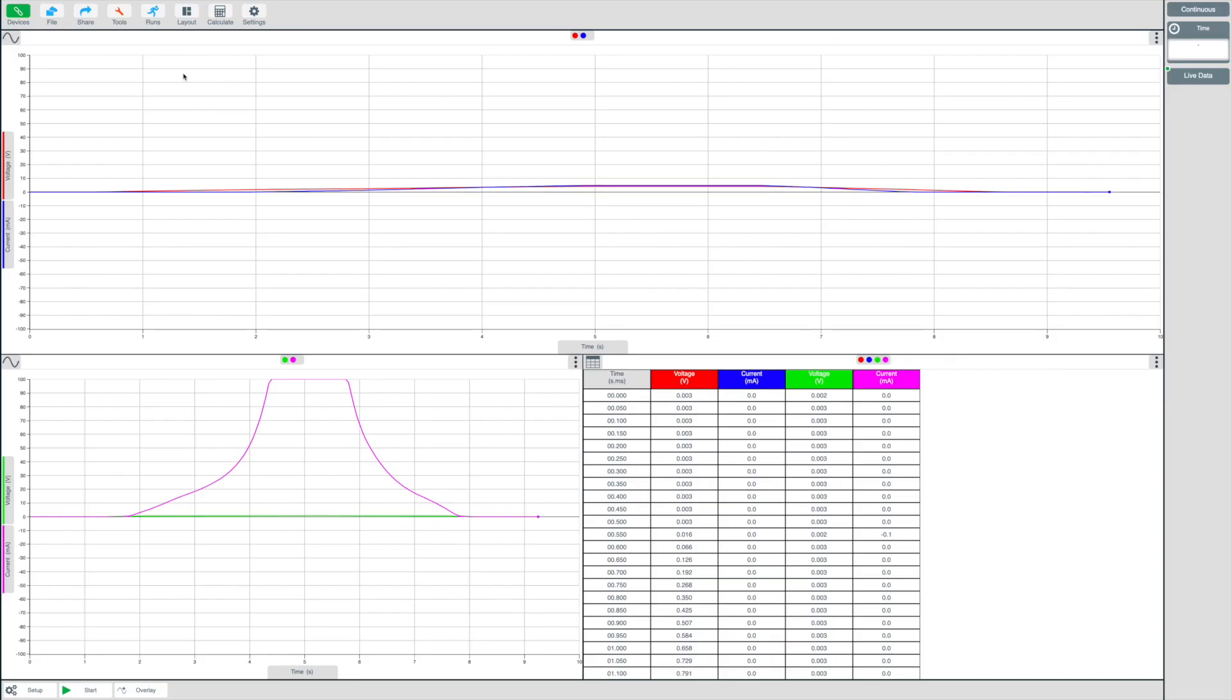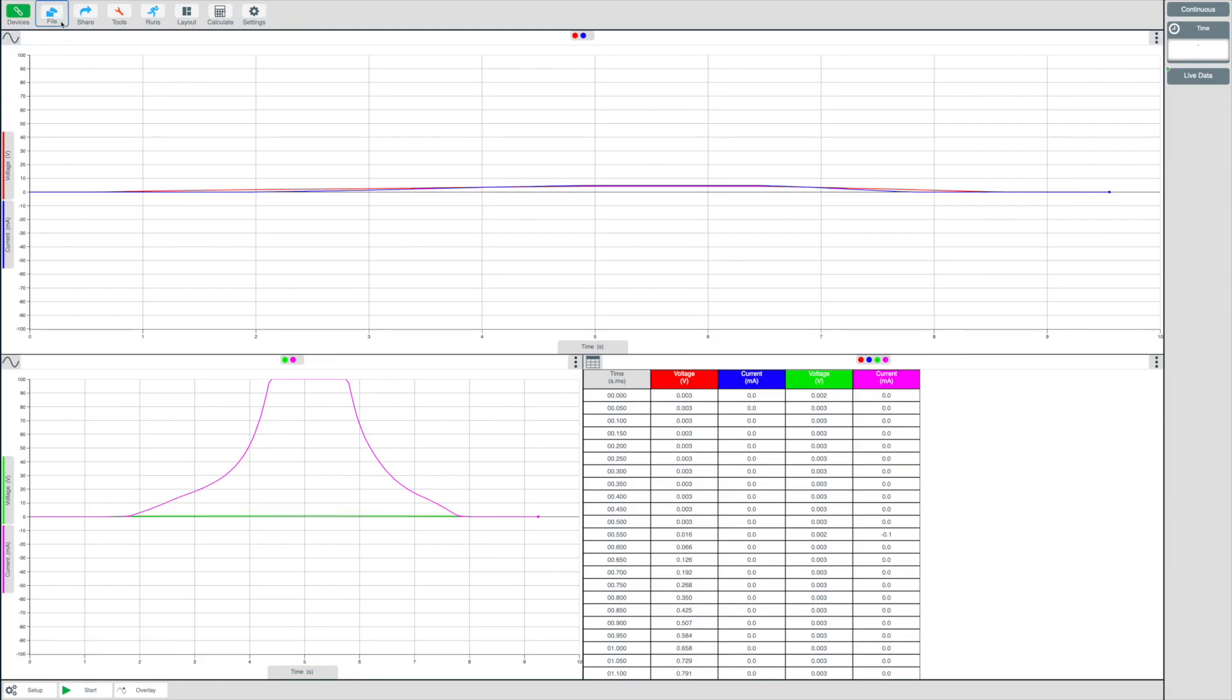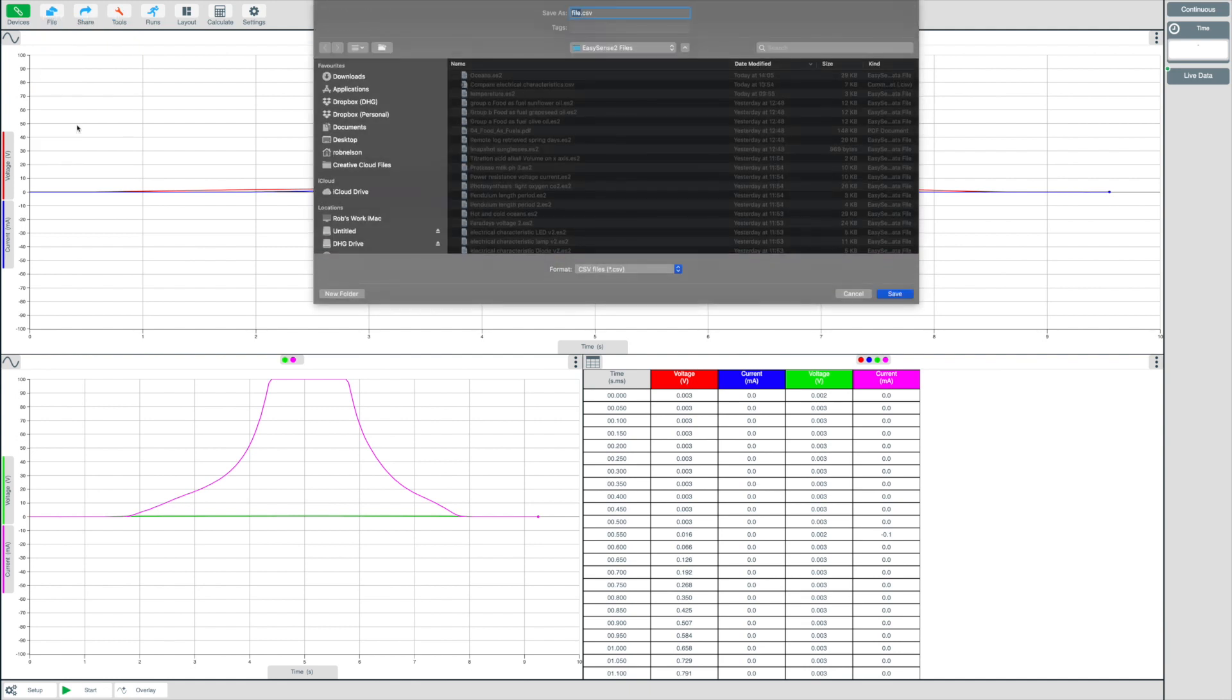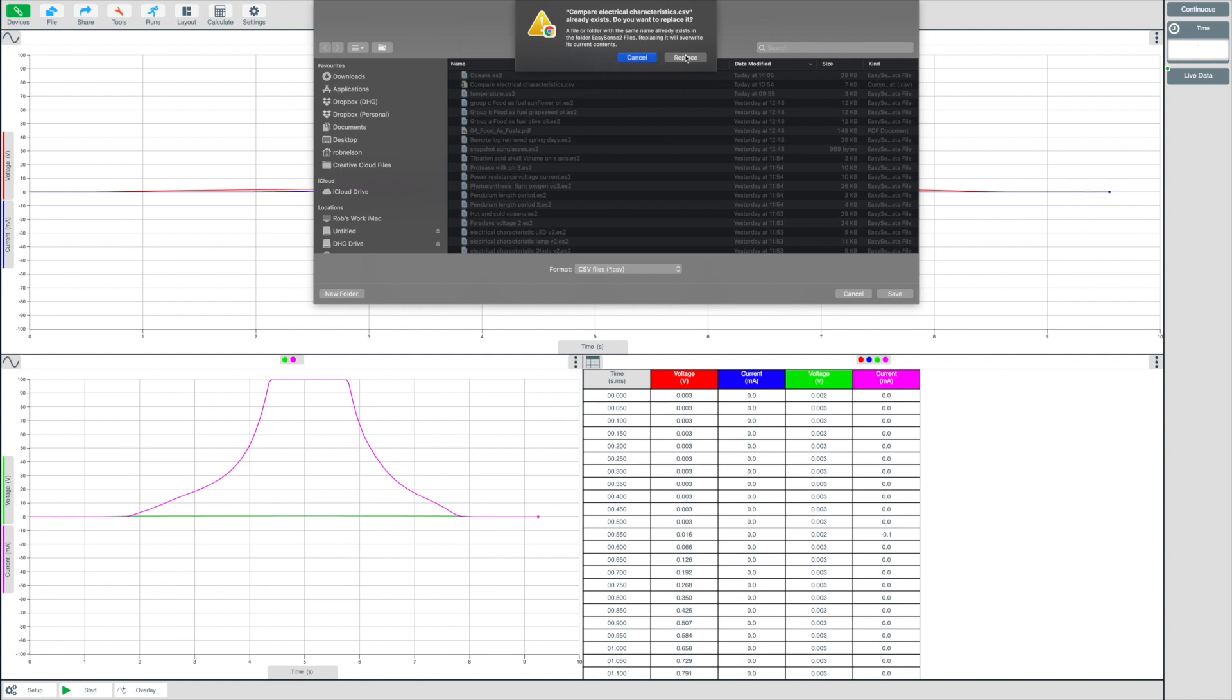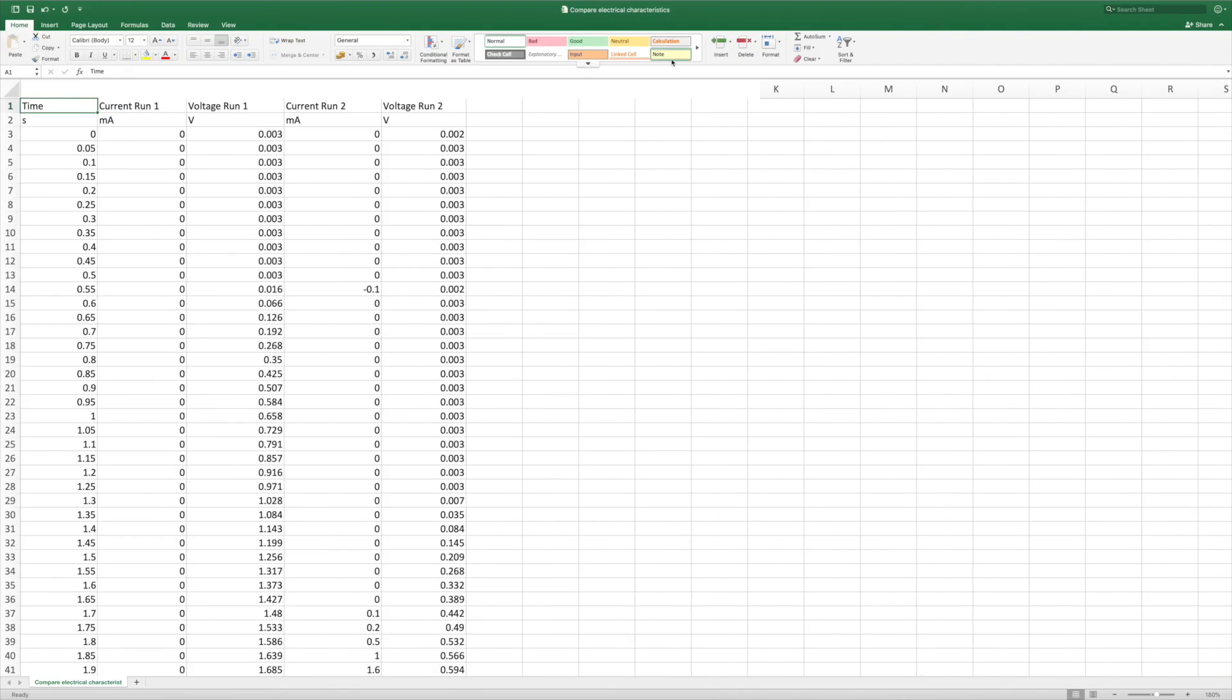In some cases, you may want to export that data as a CSV comma separated values file for use directly within your own spreadsheet application. Let's see this in action. From the file menu, select Export CSV and name your file. Now select Save. Open your spreadsheet application to view the recorded data.